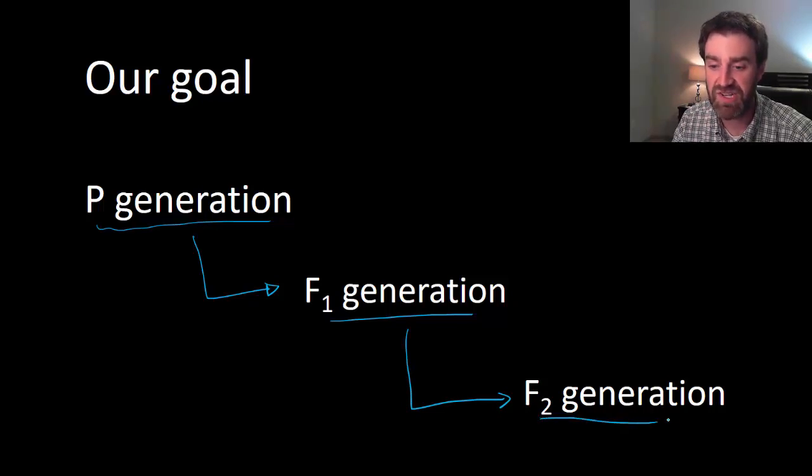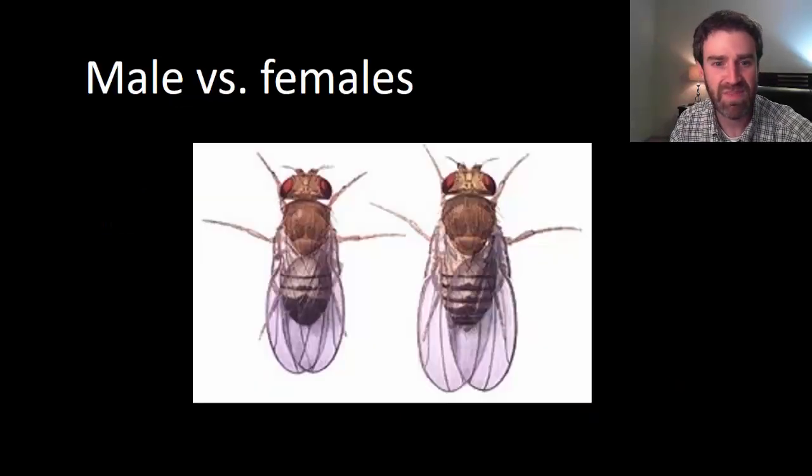That's going to be an easier generation to look at because they're the last generation, so we're going to be able to kill them in advance, so that makes it much easier for you to look at them and what traits they have without worrying about them waking up. If we're going to look at fruit flies, you're going to want to be able to distinguish between males and females so that you can put some males and females into a culture jar, and so that just in case a trait is also determined by sex, you can also find that pattern.